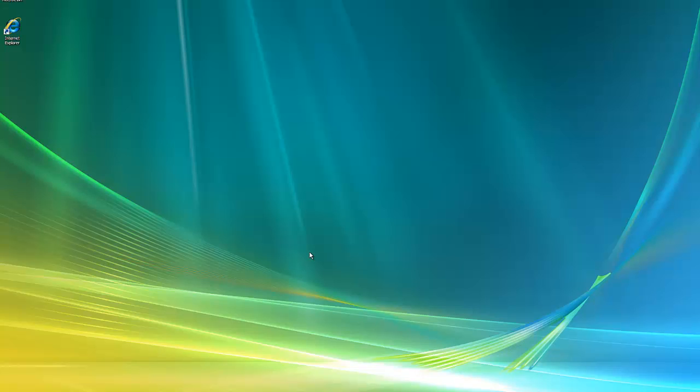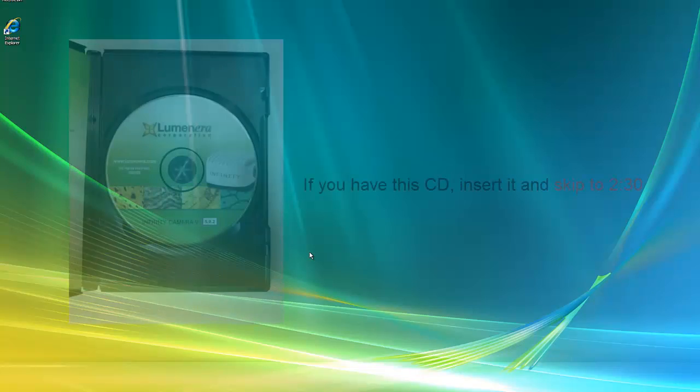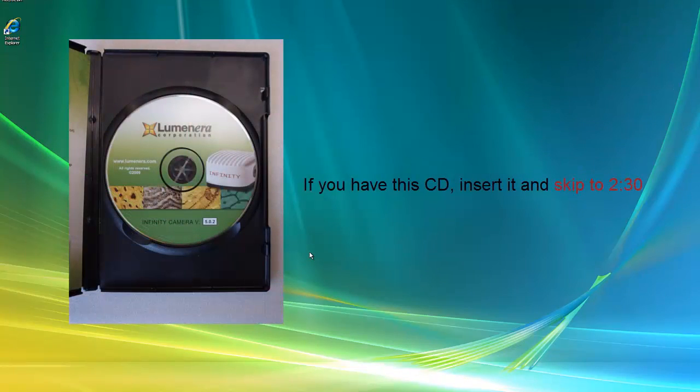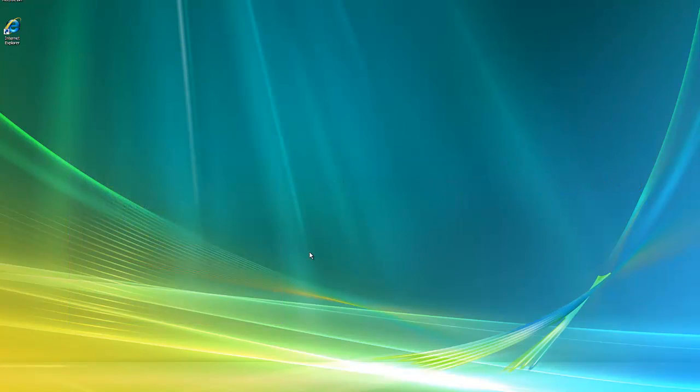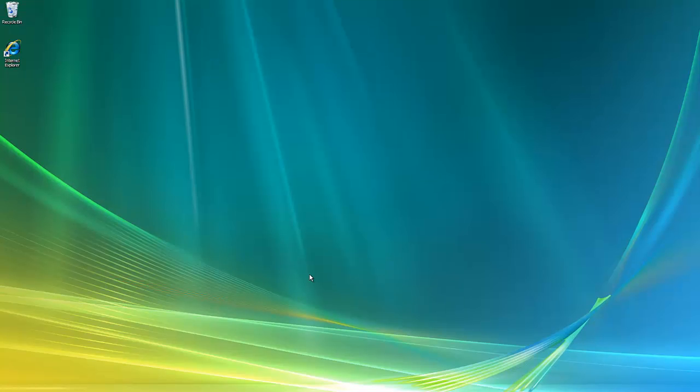Let's get started. If you have an installation CD, you can insert it into your computer and skip ahead in this video. If you don't have an installation CD, you'll have to download the camera software from Luminaria's microscopy camera downloads webpage.